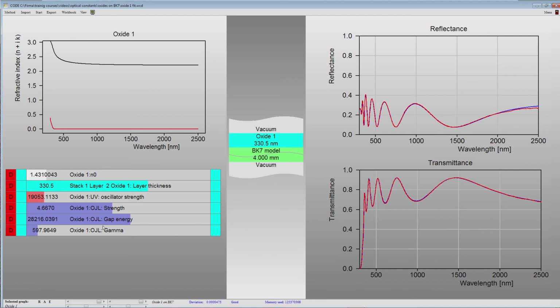And the goal there is to get the thickness profile of the layer and the change of the optical constants versus position. And I will show in another tutorial how to do that in a batch operation.